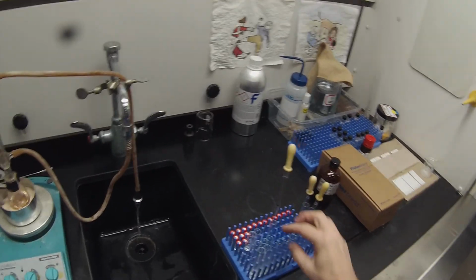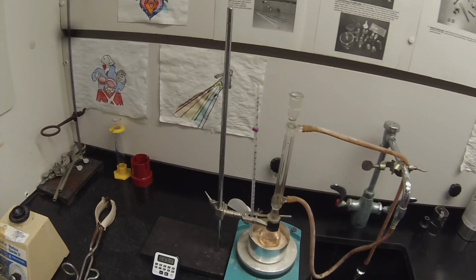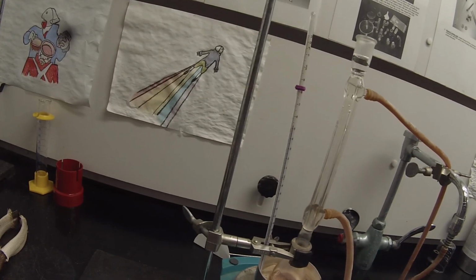Alright, so we got a slightly colored solution this time. Probably can't see that. Gradually going more pinkish. I think you'll see that that's a little bit pink now. And we're at 153.